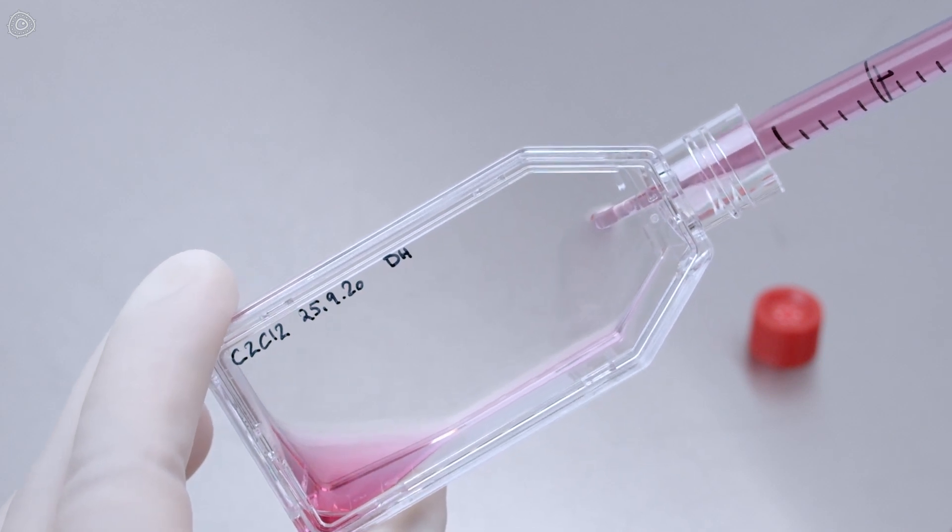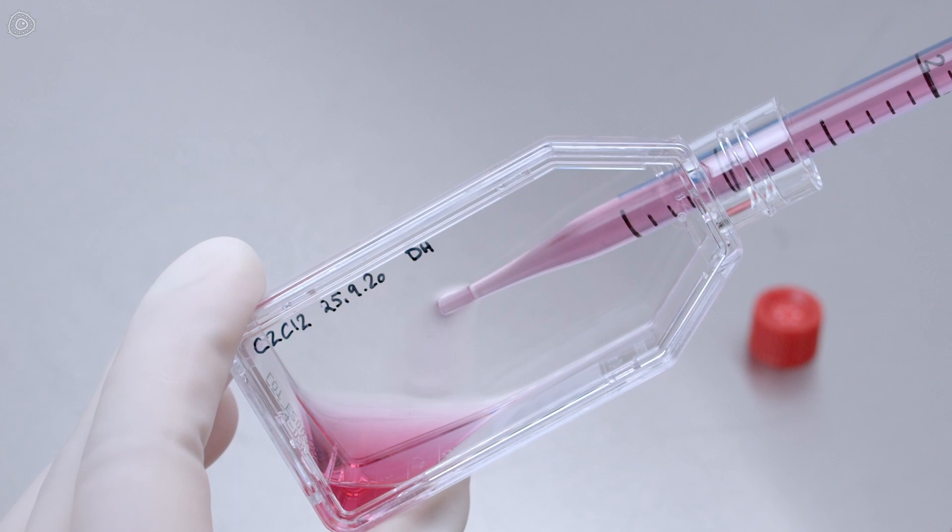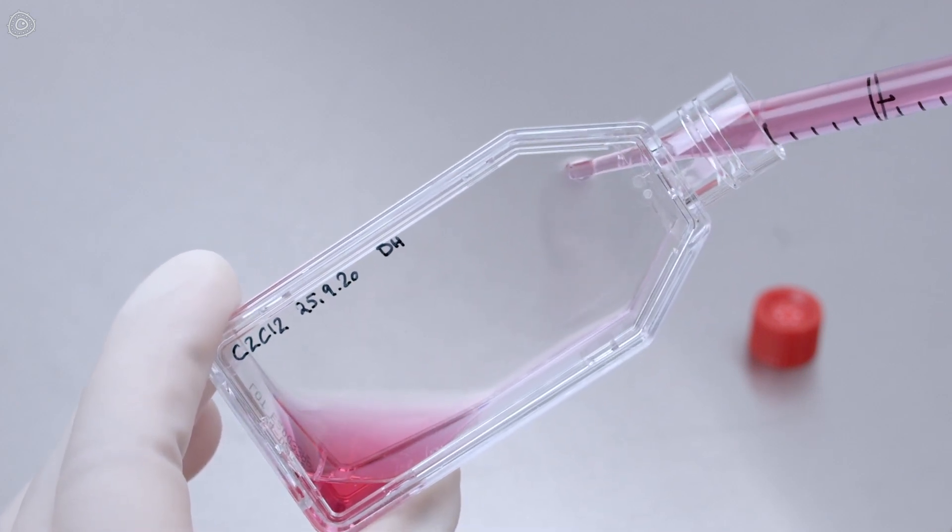So if you change things such as trypsin concentration, seeding cell concentrations, or the time you incubate your cells with trypsin or any other agents in the middle of your experiment, your experiment may not be reproducible.